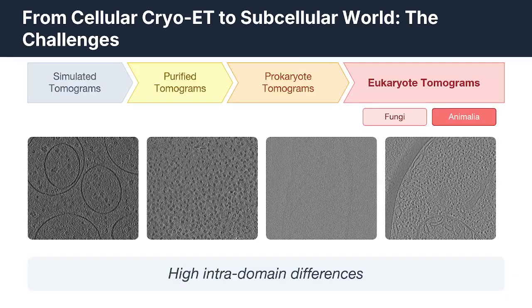Furthermore, these volumetric images have high intra-domain variability. For instance, a tomogram of a bacteria cell is highly different from a human cell. Even images of the same cell across different biochemical environments are very different. So even after burdensome annotation on a set of these images, training a supervised model using the annotations does not help much in generalization.